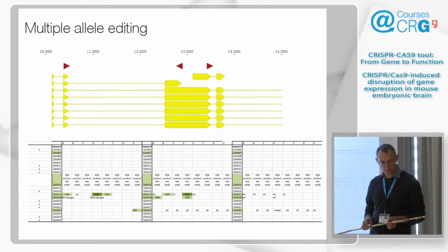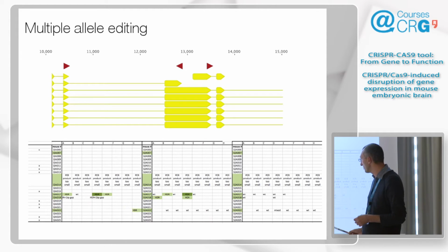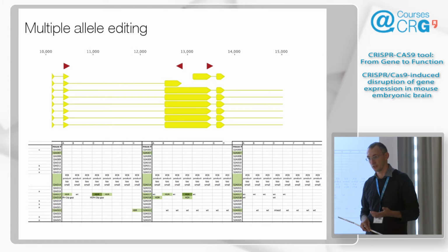Some lessons we learned from that project, which you probably encountered a lot. Many of these mutations, we have to have them on the same locus, right? The heterozygous is not useful. We need the protein to have all 3 mutations. And we were quite happy to see multiples, these dark green ones, that appeared as homozygous. But actually, that's not the case.